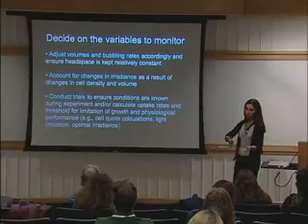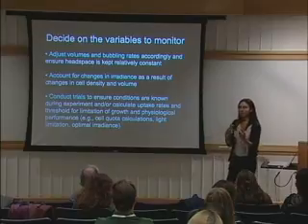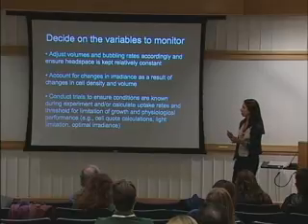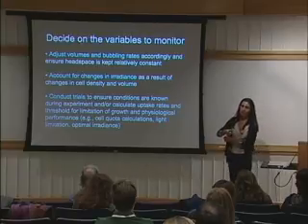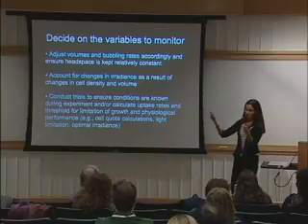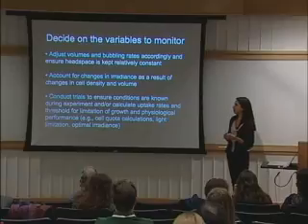So if you remove your sample, you need to think about supplementing this culture with preconditioned, pre-bubbled seawater, if you're working with a bubbling system, and basically adjust the volumes. If you sample at time 0, in the middle of the experiment, and at the end, or if you sample more often, it's a lot of work, but you just have to do that.